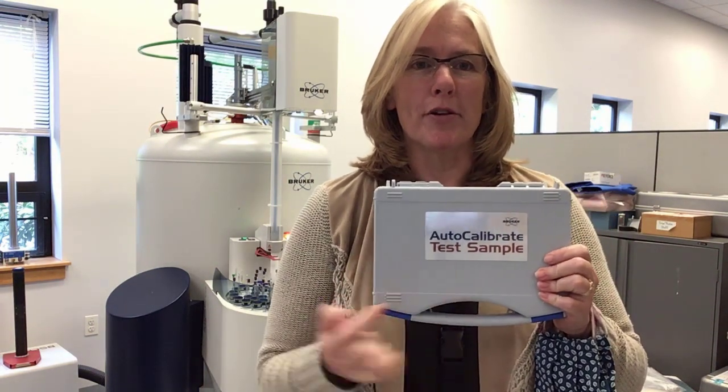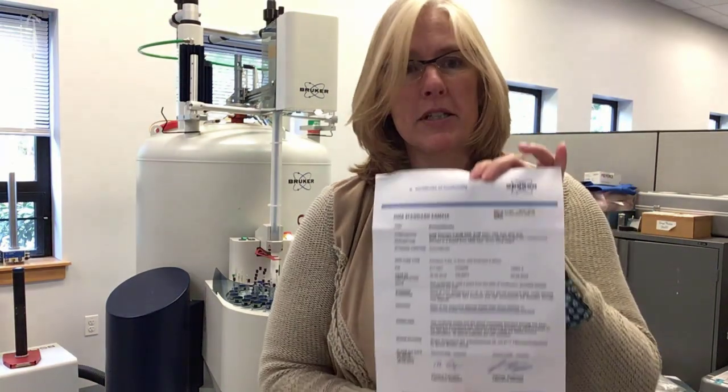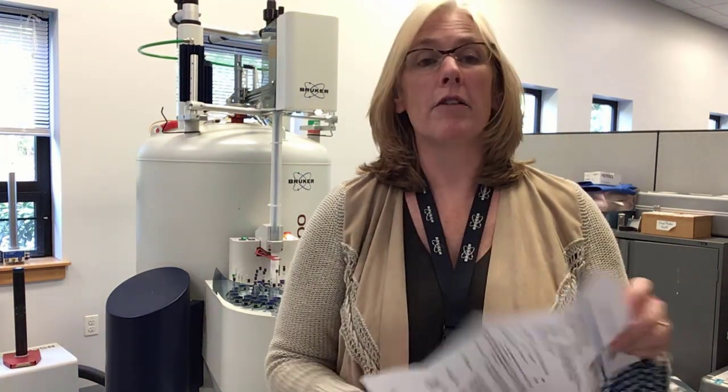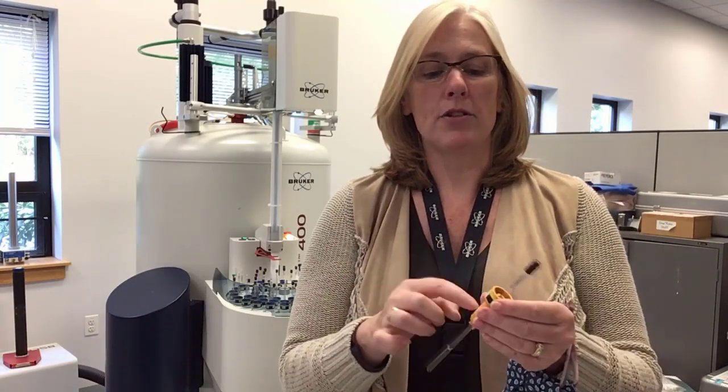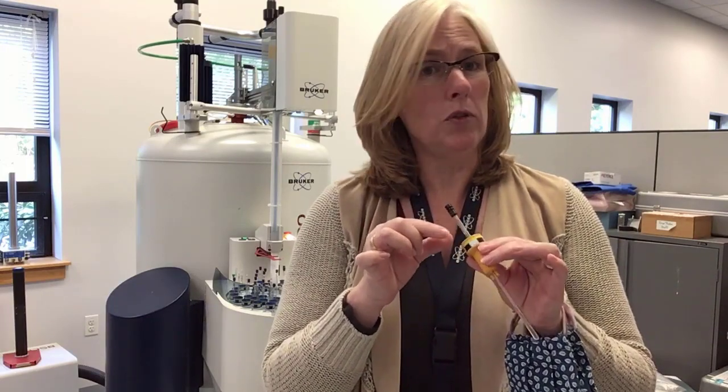So after you order your AutoCalibrate sample, you'll receive a box like this that says AutoCalibrate Test Sample. Inside will be a quick guide on how to set this up, along with the Certificate of Authenticity, which tells you the expiration date of the AutoCalibrate sample. The sample itself is attached to a special spinner and it is glued in so it doesn't move.